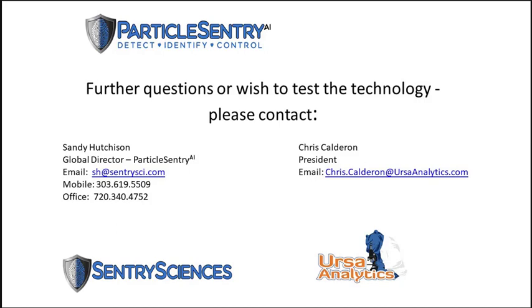Yes, it is. There's a variety of ways you can do that. You can retrain the network completely from scratch if you have a new set of conditions that you'd like to incorporate. Or there's other techniques where you can freeze the conditions you had before and continuously morph or add new information in to try to keep the old fingerprints in the same position. So those are 2 options. It just requires having a new set of training images that are labeled, that you know where they came from. So yeah, it's rather easy.